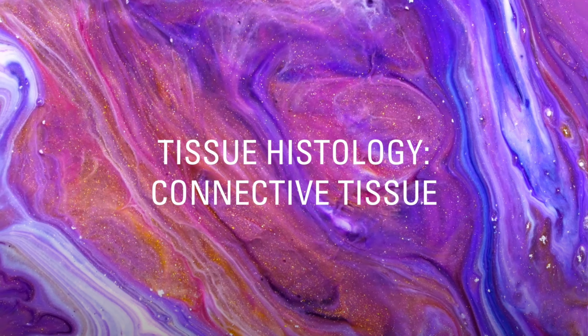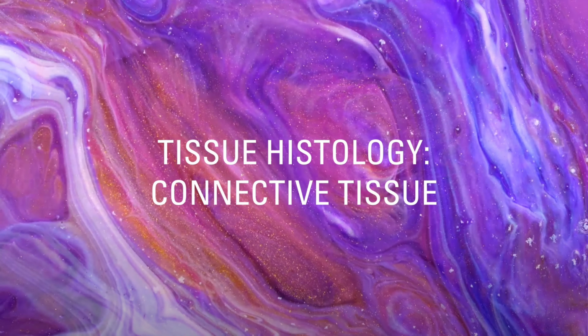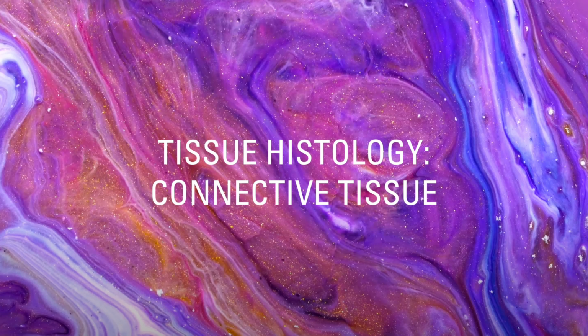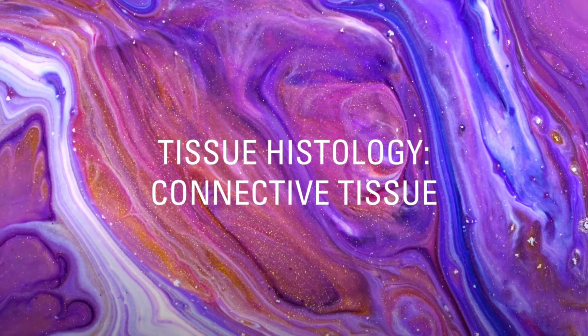Becker here to discuss the second major tissue type in our histology lab, connective tissues. First, we'll cover the general characteristics we look for that identify connective tissues. Then we'll examine each type of connective tissue and what makes it unique from other connective tissues.